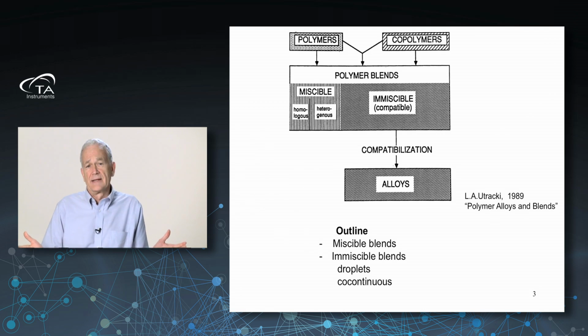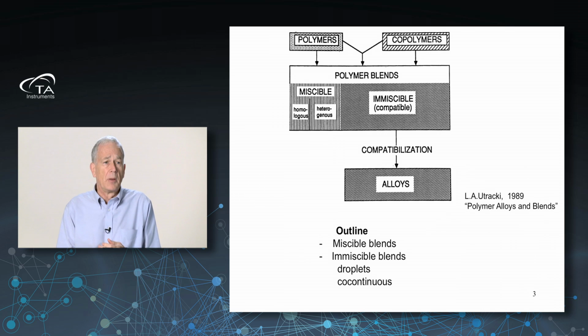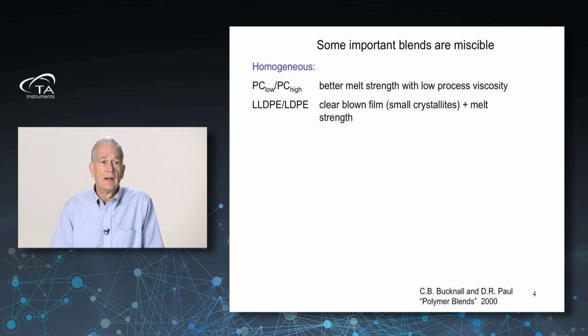Practically all plastics that we get today are some kind of a blend. So I think this is a pretty important area to try to understand, and rheology is a powerful tool to analyze them. Let's look at some applications, examples rather, of miscible blends.